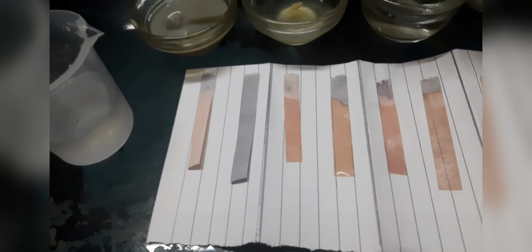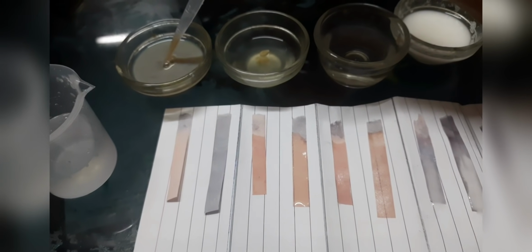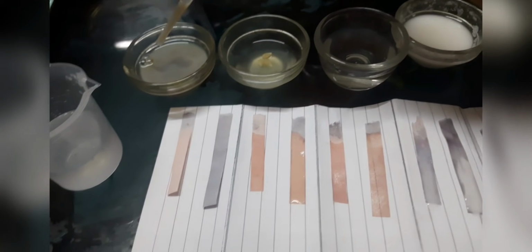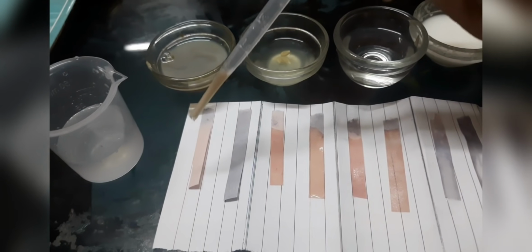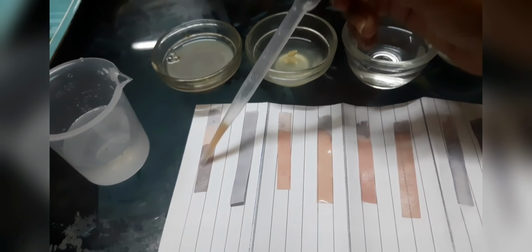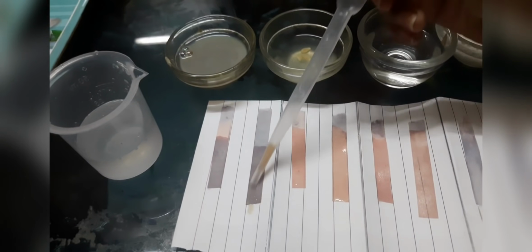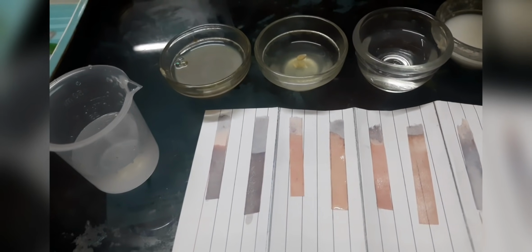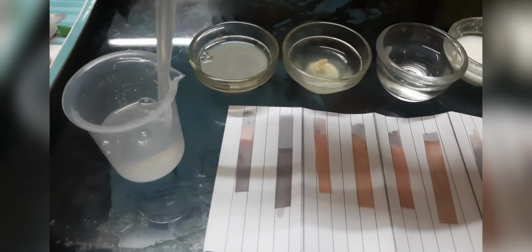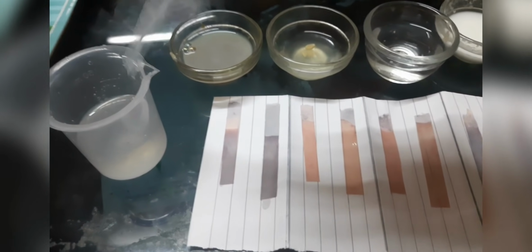So over here, let's take the phenol. It's very harmful, so I will do it quickly, fast. Red litmus. Drop it on the blue litmus. Clean the dropper again. And here we go.